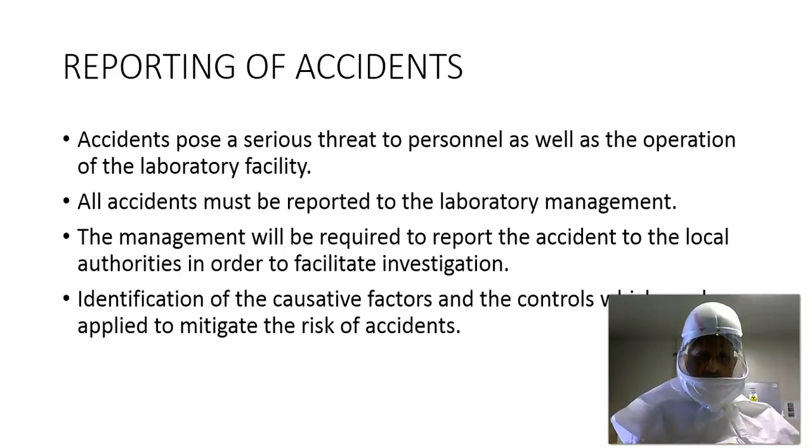Reporting of accidents. Accidents pose a serious threat to personnel as well as the operation of the laboratory facility. All accidents must be reported to the laboratory management. The management will be required to report an accident to the local authorities in order to facilitate investigation. Identification of the causative factors and the controls which can be applied to mitigate the risk of accidents is essential in order to prevent recurrence of these accidents.